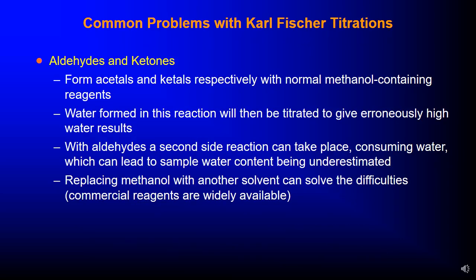Common problems with Fischer titrations, continued. Aldehydes and ketones form acetals and ketals respectively with normal methanol-containing reagents. So the water formed in this reaction will then be titrated, giving erroneously high water results. With aldehydes, a second side reaction can take place, consuming water, which can lead to sample water content being underestimated. Replacing methanol with another solvent can solve the difficulties.